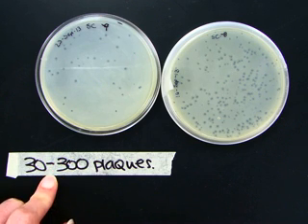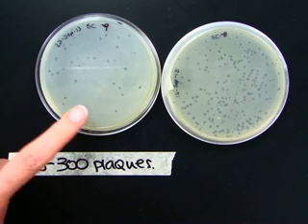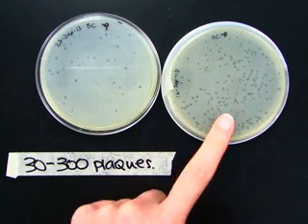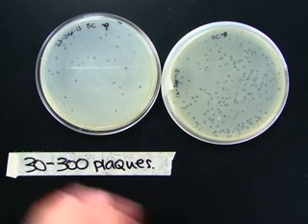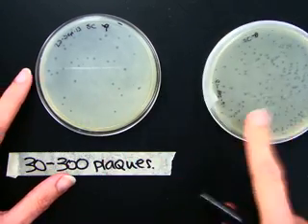The plate that you're going to count is called the countable plate, and you want that plate to have between 30 and 300 plaques on it. These are two different examples of plates that fall within that realm. This one obviously is going to be closer to 30, and this one's going to be closer to 300, but either or both of these could be counted. But I'm going to show you guys counting on this one.